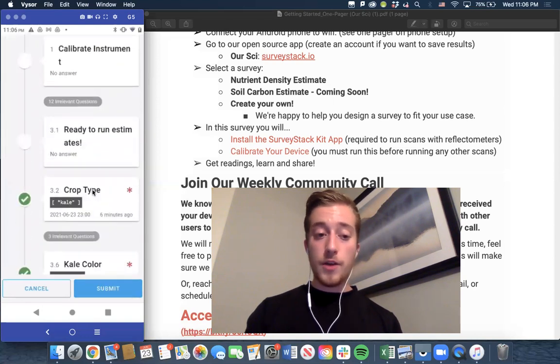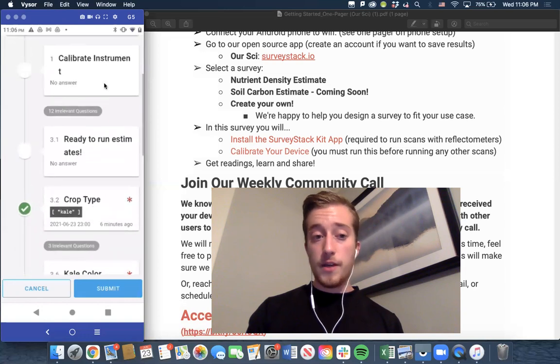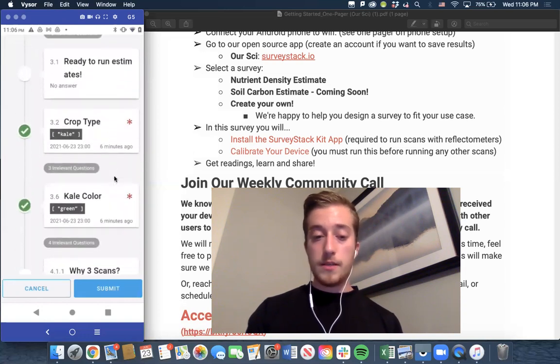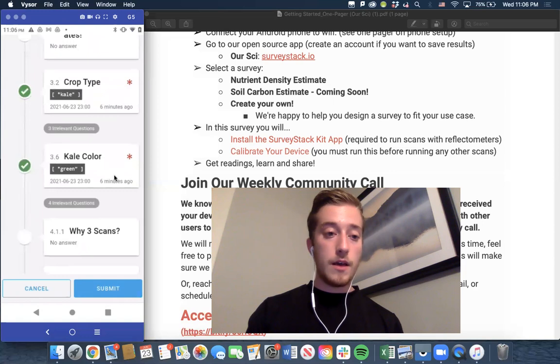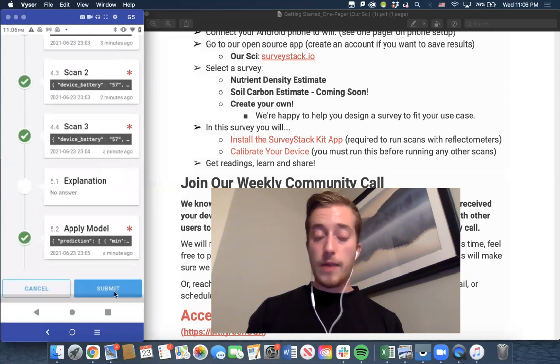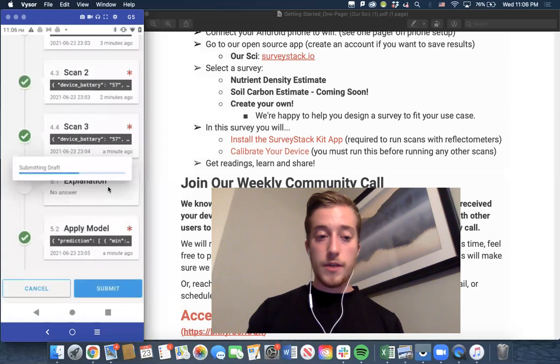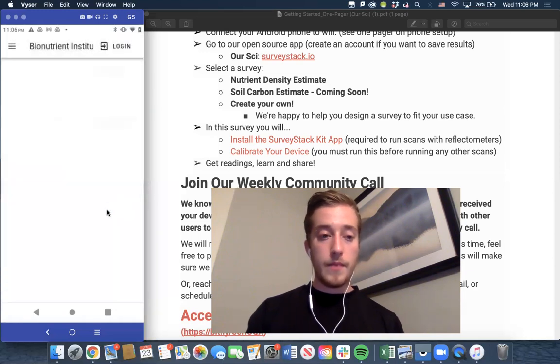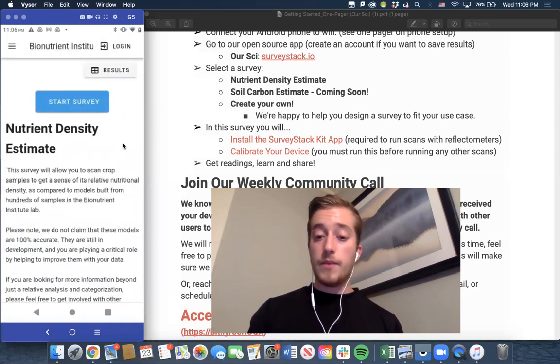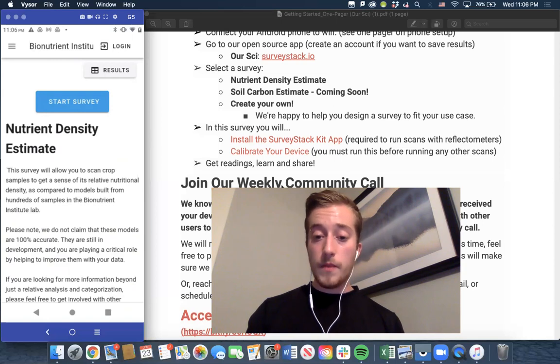And this is just a summary of my survey. I didn't calibrate my instrument this time, and that's okay because it was just calibrated before this video. I chose my crop type, the color, I ran my 3 scans, and I applied my model. So now I can click submit and confirm submission. Okay. And then it spits me back out at the beginning of this survey, so I could run it again if I want to.